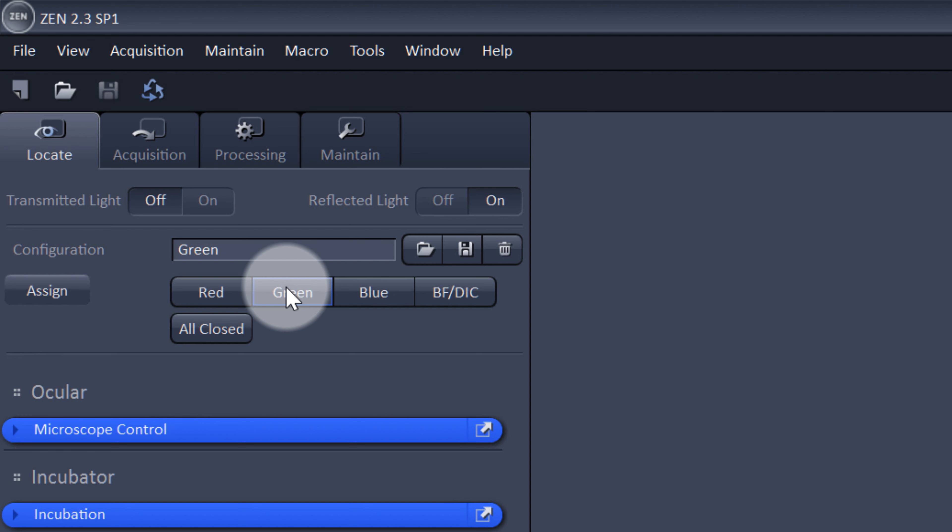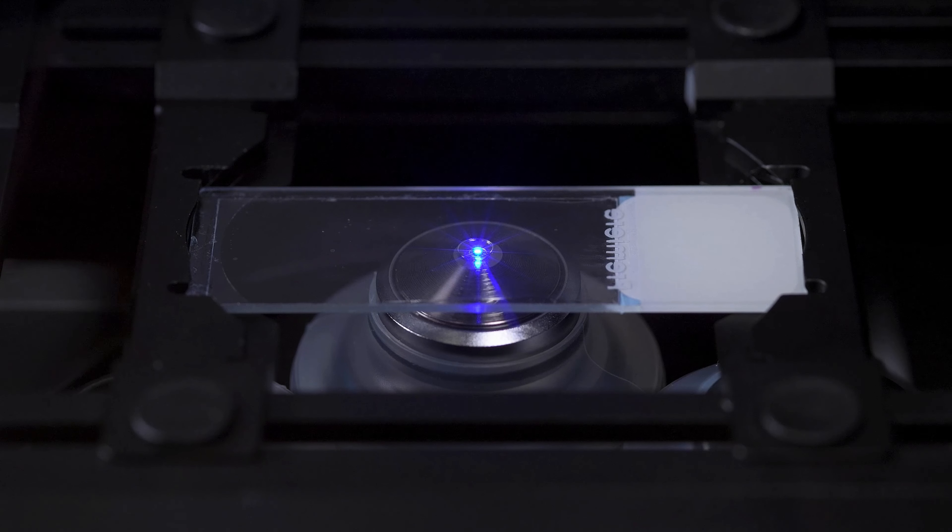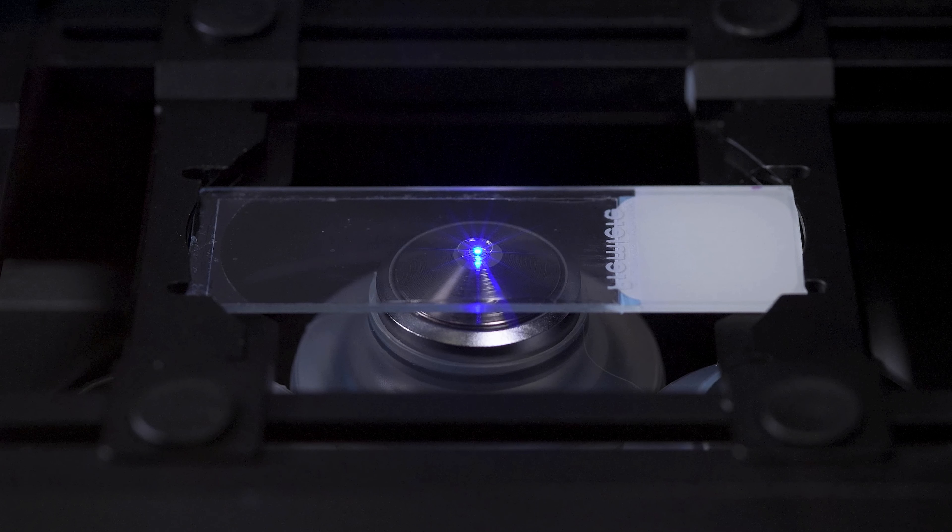We recommend selecting a channel where you expect the most fluorescence. For many that use DAPI as a nuclear marker, this channel is a common choice. The human eye is much more sensitive to green range wavelengths, however. So if you know you have good labeling in the green channel, this is our preferred option. Since oil is now touching the objective, our focus position is very close to where it needs to be. So from here we will only use the fine focus knob on the microscope.